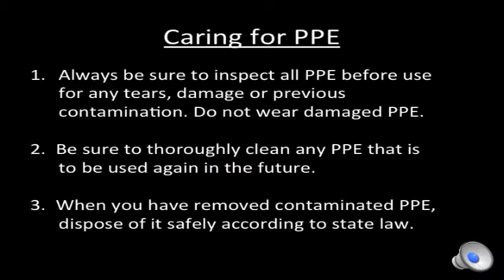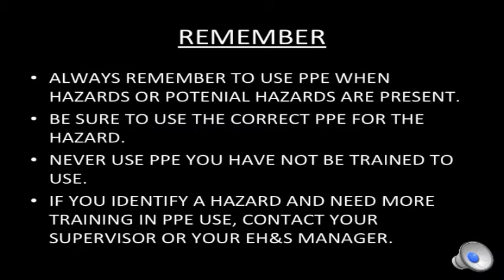When you have removed contaminated PPE, make sure you dispose of it according to state regulations. It may need to be packaged and disposed of as a hazardous waste. Check with your environmental health and safety manager for more information.